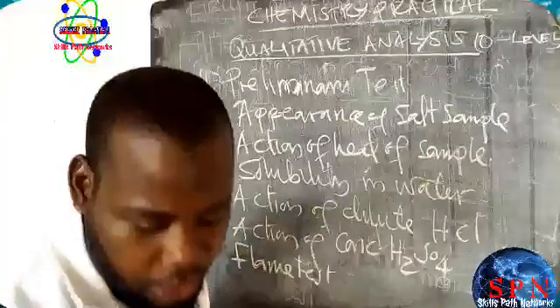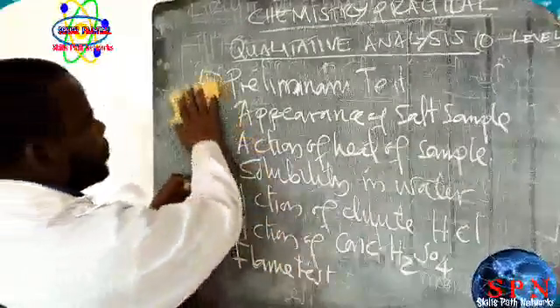That is the preliminary test. The second one is testing in solution.